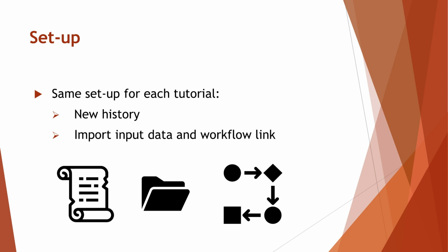And then, on the far right, I have an icon to represent a workflow. A workflow contains a series of tools represented by the shapes that have been preset with parameters, and once you start a workflow, it will run each tool automatically.